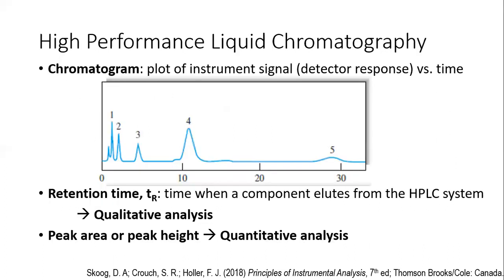So same with your gas chromatograph, you will also obtain a chromatogram from your HPLC. Ganun din yung makukuha yung info. So you will obtain your retention times and the peak area or peak height.